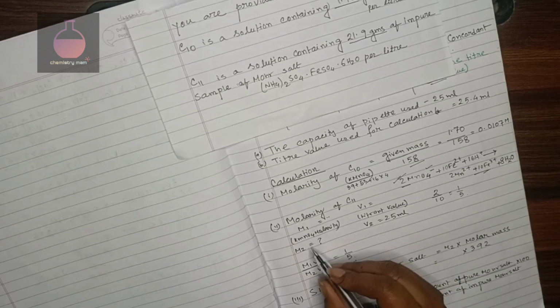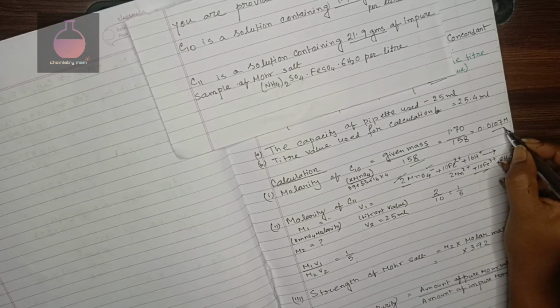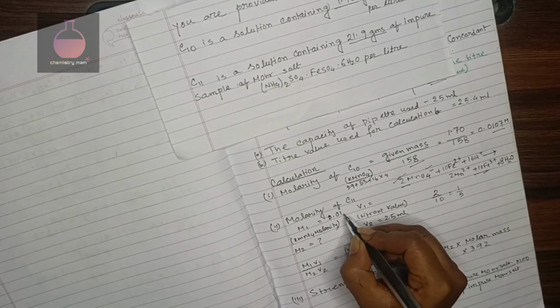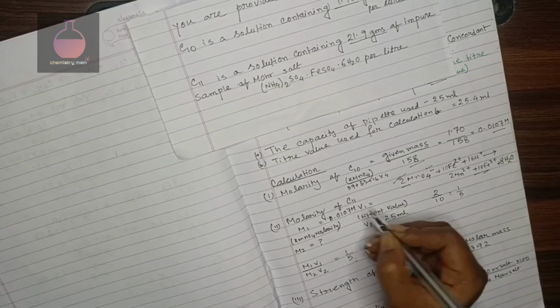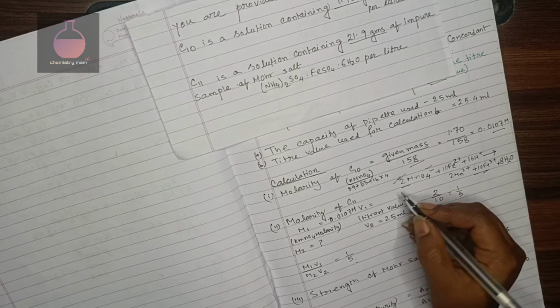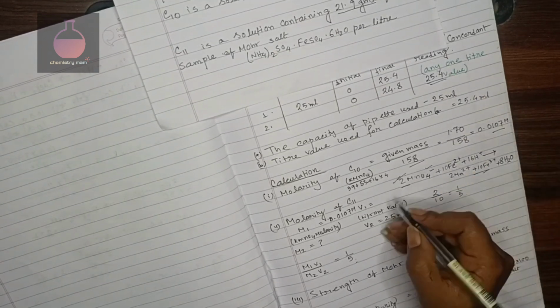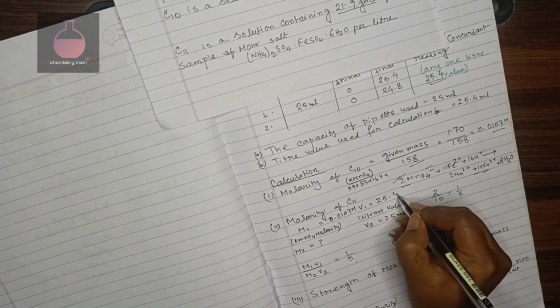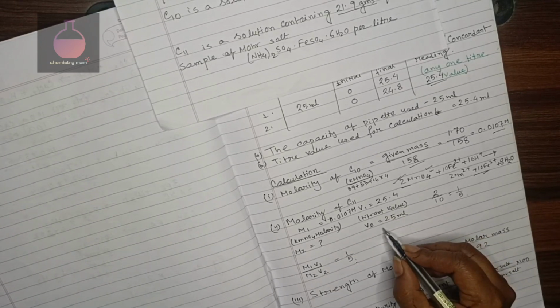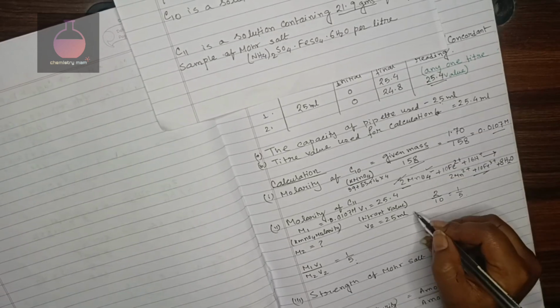Now M1 means KMnO4 molarity. From where is it coming? You have calculated it here, 0.0107 molar. V1, from where is it coming? That is your titrant value, whatever you have used, 25.4. Then M2 is your question. V2, 25 ml, is the pipette value you are using.